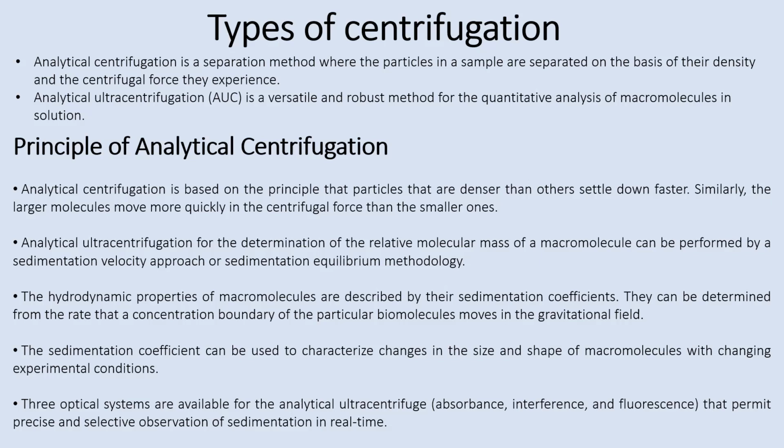Now, three optical systems are available for the analytical ultracentrifuge: absorbance, interference, and fluorescence, that permit precise and selective observation of sedimentation in real time. There are a lot of updates in this area, so you can now study what is happening right now. Based on that, a lot of information is obtained on the particular biomolecule. So what is the absorbance, the interference, the fluorescence? Is the biomolecule of your interest right now in the sedimented state, or is it still in the process of sedimentation?